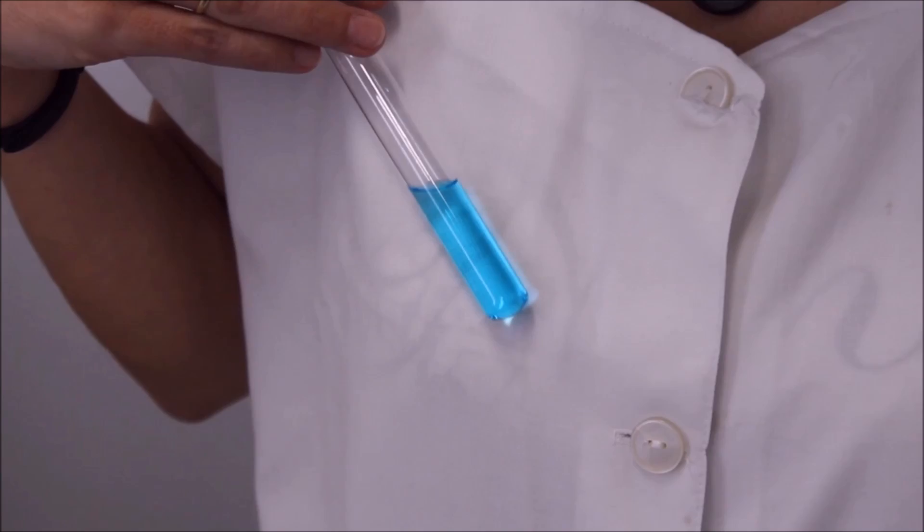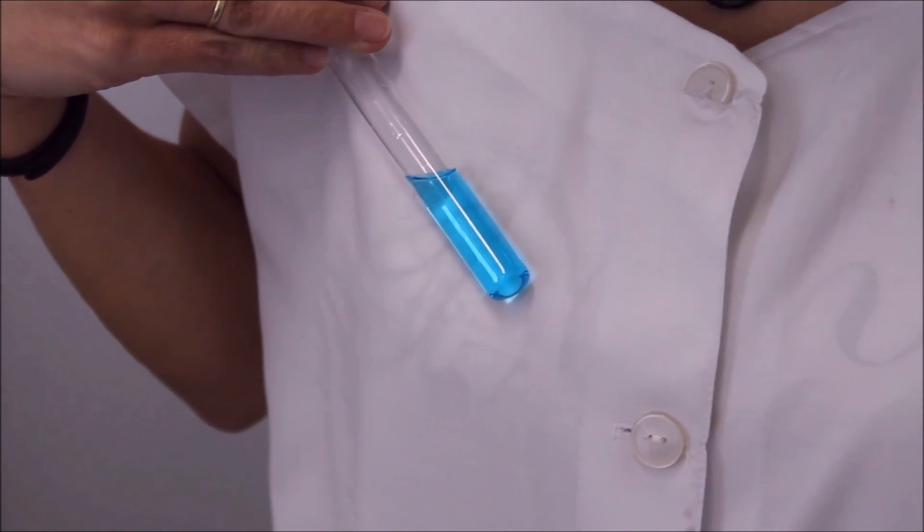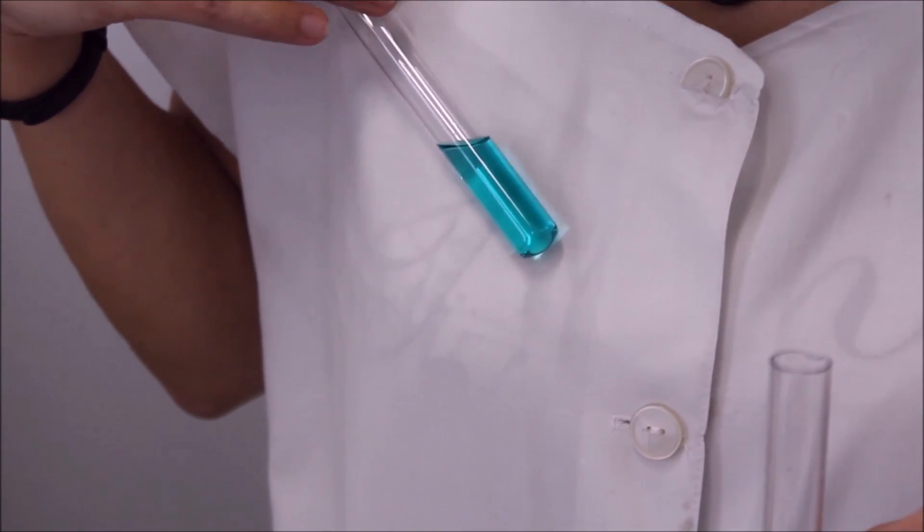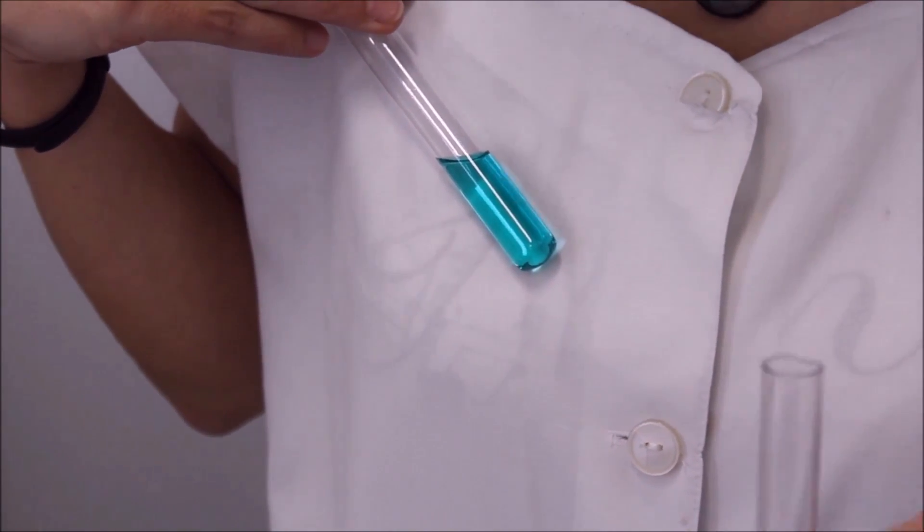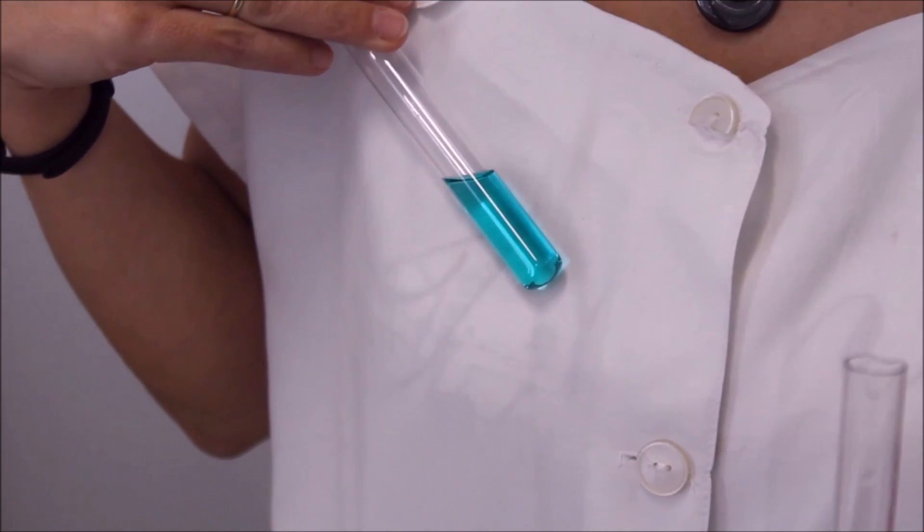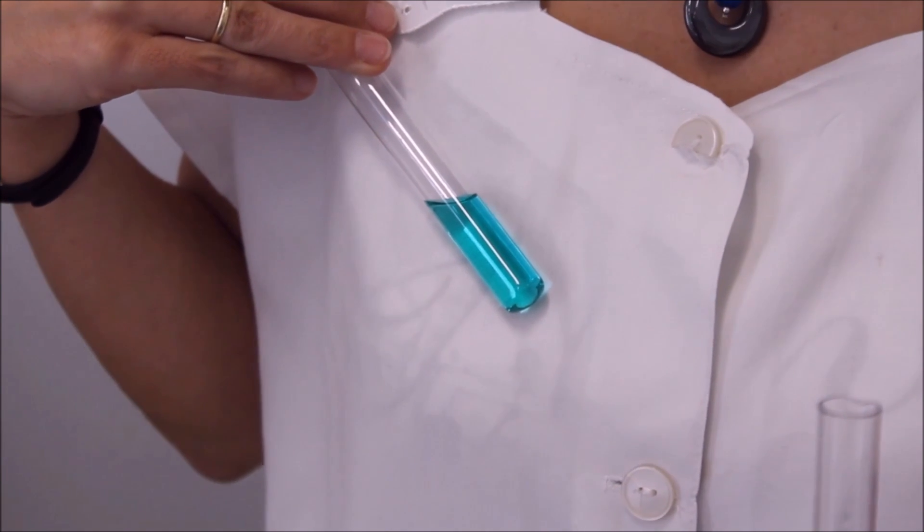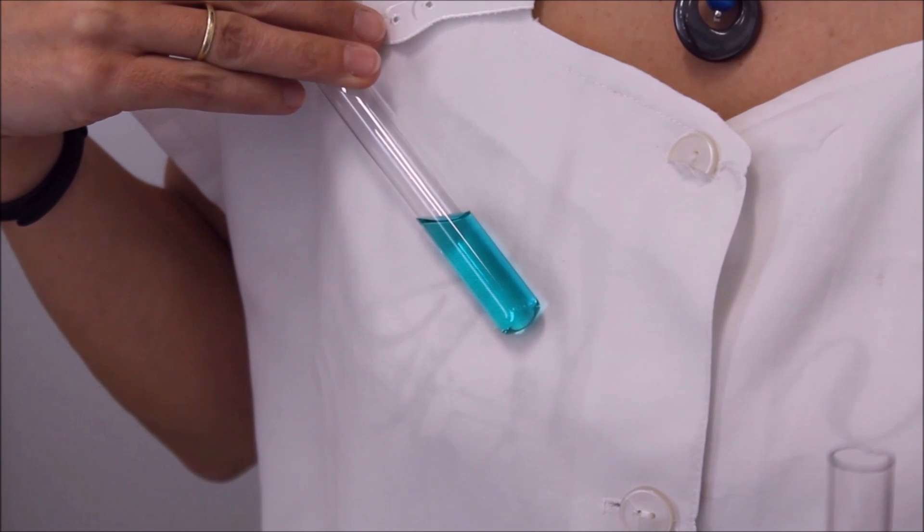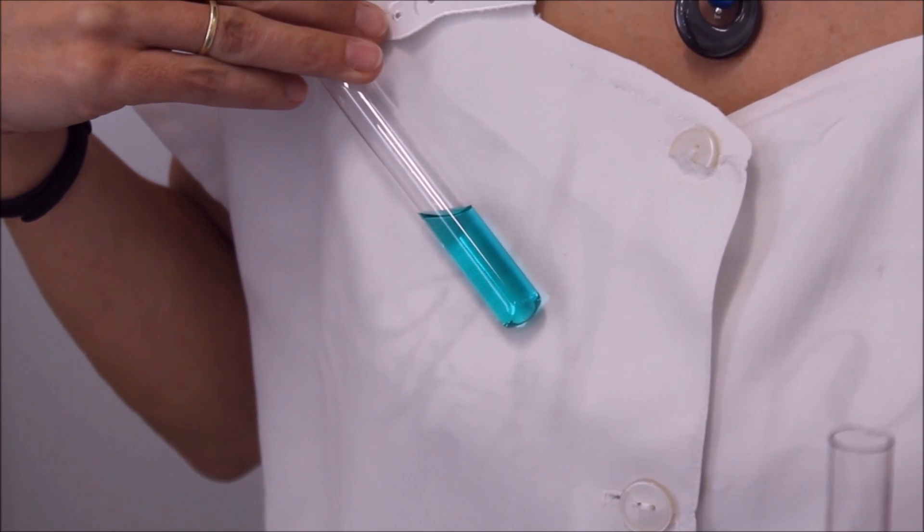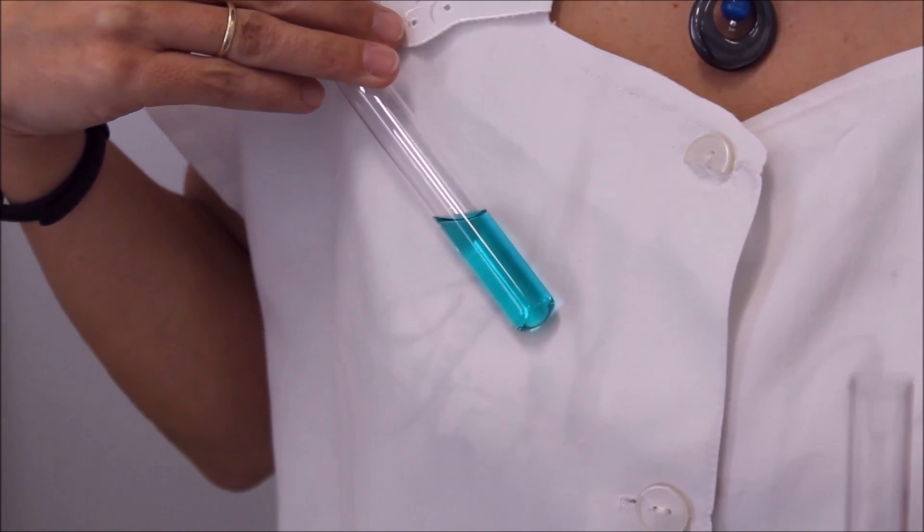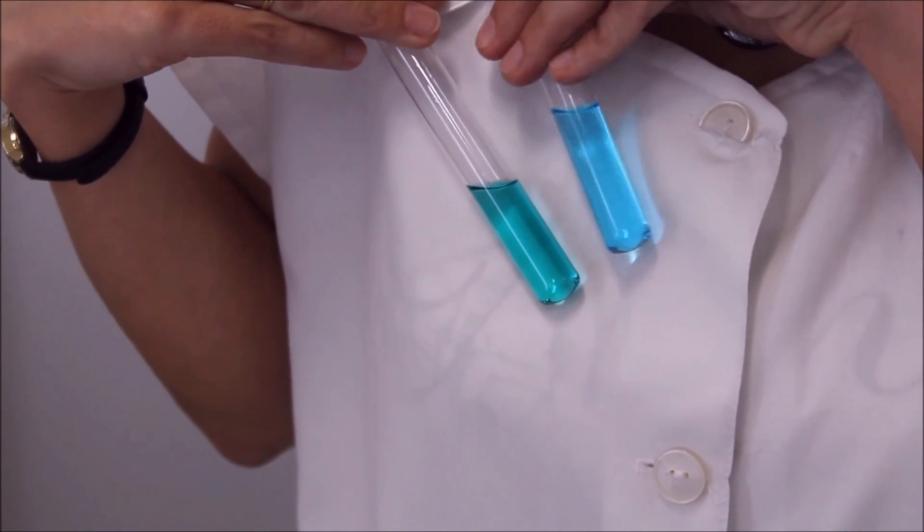A részszulfát oldat gyönyörű kék színű. A káliumbromid hatására az oldatban már rész tetrabromid komplexionok is vannak, amelyek zöld színűek, de az egyensúlyi elegyben a kék színű részszulfátionok és a komplexionok egyszerre vannak jelen, ezért ilyen kéke-zöld színű az oldat.